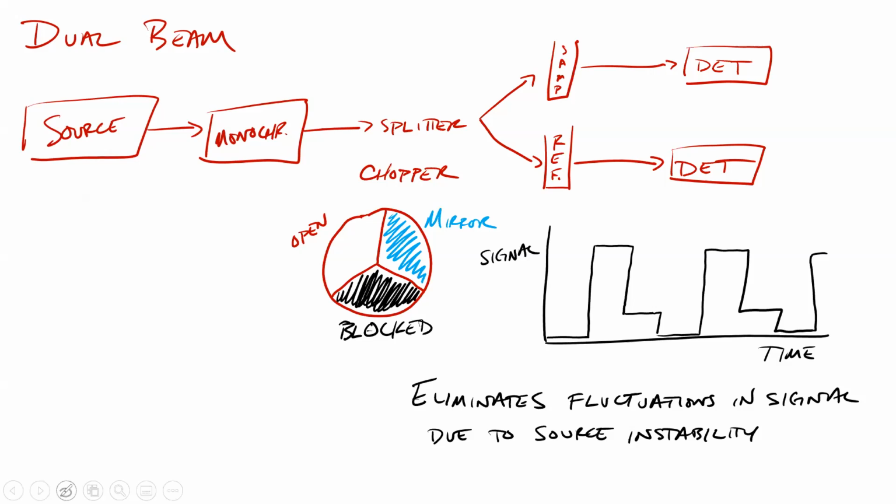Quick review kind of question for you. I said, let me draw a line here. I said that this was the reference and this was the sample. If the reference is generally not colored, right? We think about doing a UV-Vis, that our blank is often water or whatever our solvent is. And so if our reference or our blank is a much higher signal than our sample, but yet we zero the instrument when the blank is in there, right? That's what blank means for us. So why would it have a higher signal than the sample here?